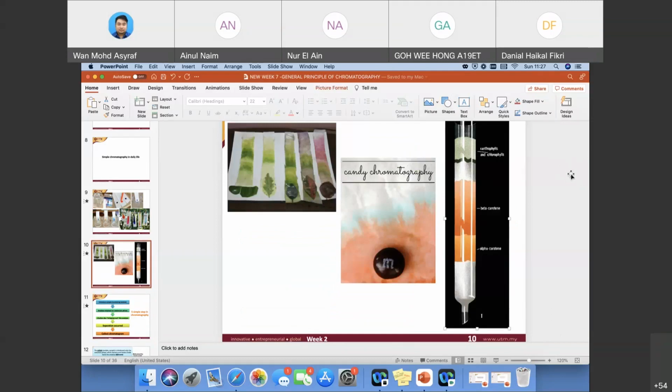Inside the plant sample, xanthophylls and chlorophylls would retain much more higher inside this stationary phase. So this is a silica stationary phase throughout. Your stationary phase here is a silica, this white thing, and then your mobile phase maybe some sort of solvent, methanol for example, right?